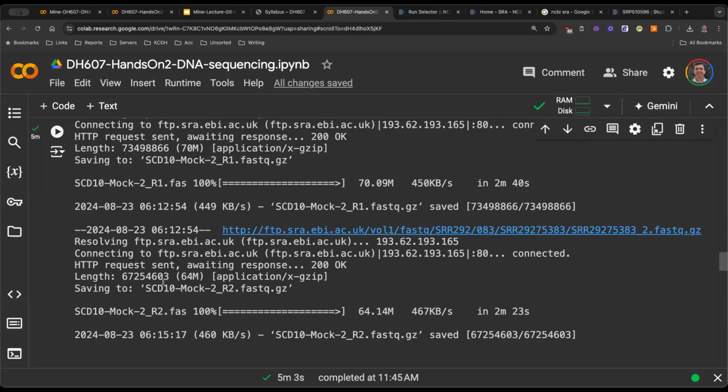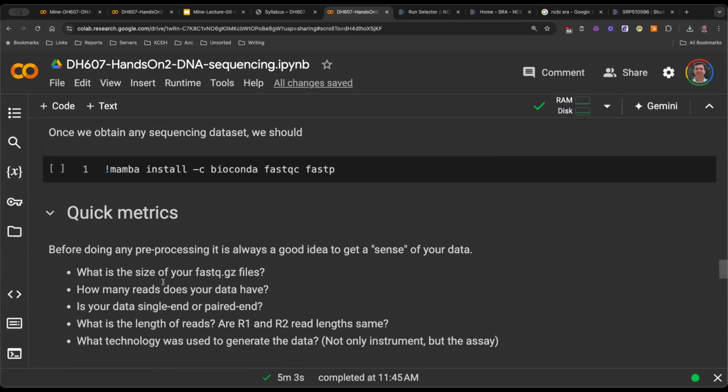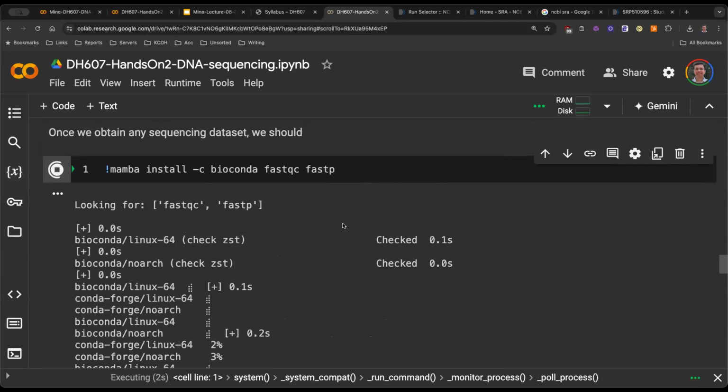I'm just trying to give you an intuition of what exactly is happening. In some cases, you will start to see adapter contamination. Your reads will also have adapter sequence. You'll see in this notebook that we get rid of this. You'll see a plot and it will become much clearer what it is. So hopefully the data is downloaded for everyone. Okay, let's move on next, and what I talked about will become very clear now, hopefully.